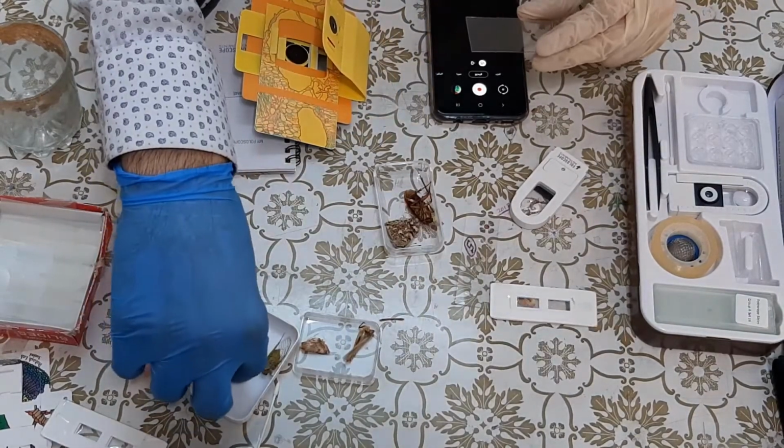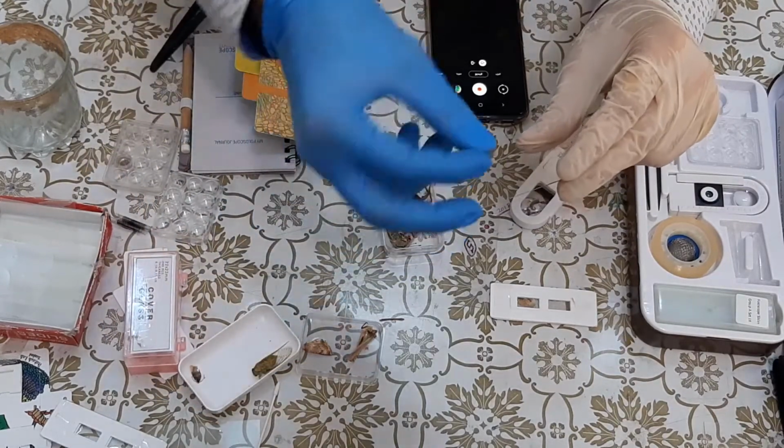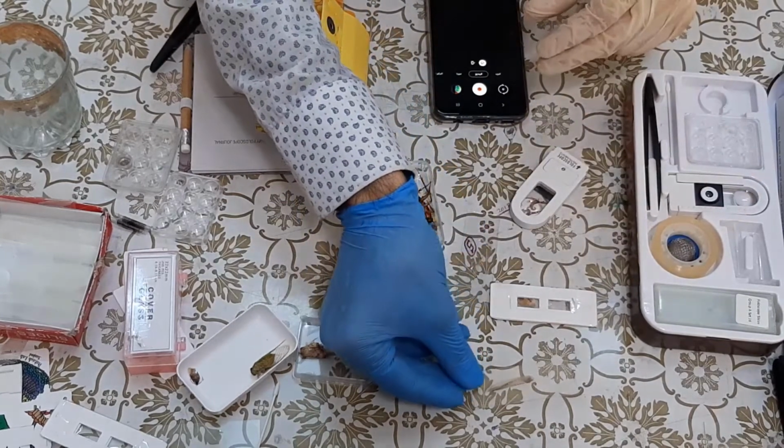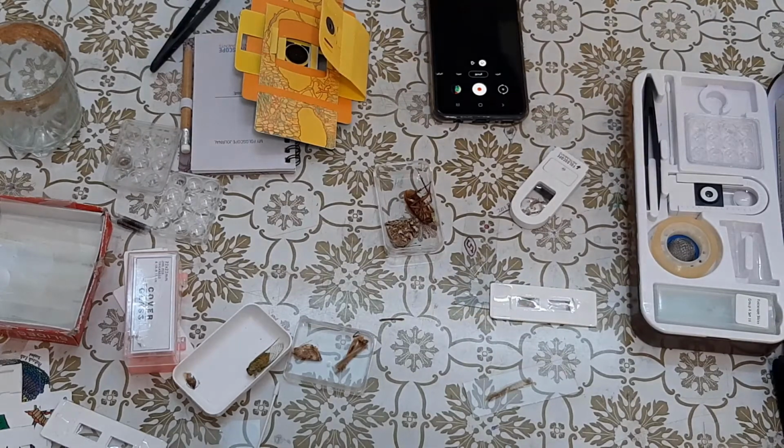I have the wing for it here already. Just simply going to put it on the slide here, as you see, and bring the tape.